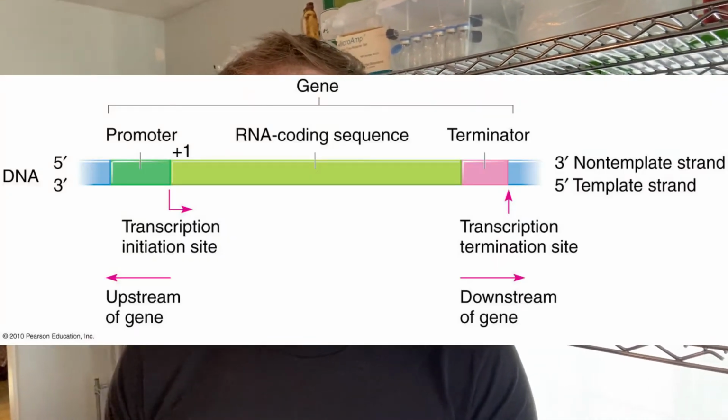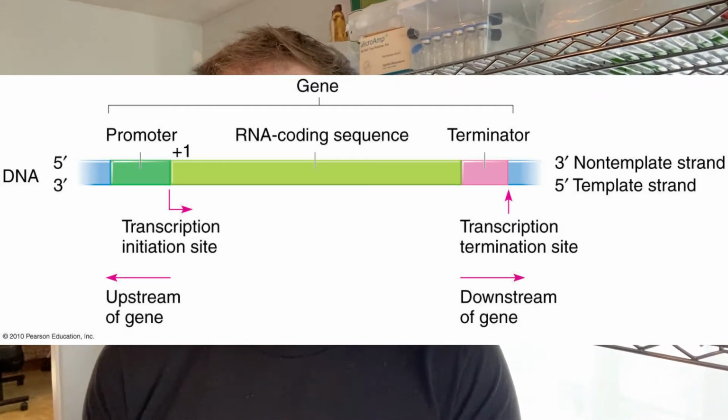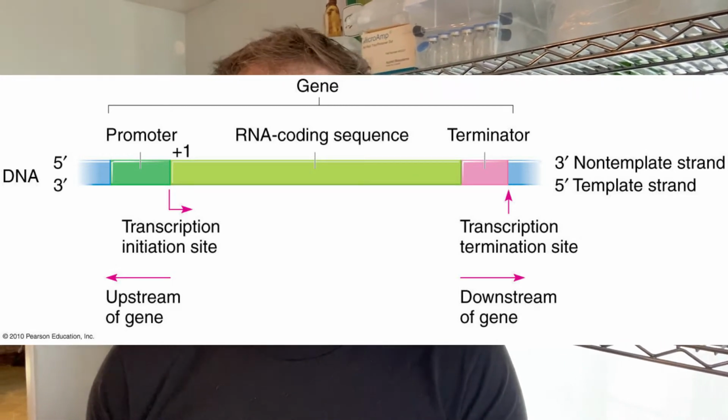And so if you're going to engineer an organism which hasn't been engineered before, there are a few things that are challenging, but that you need to do in order to be successful. One is you need to identify some common promoters that will allow you to insert genes and ensure that the machinery for that organism can properly transcribe the gene that you're looking for, and terminators.